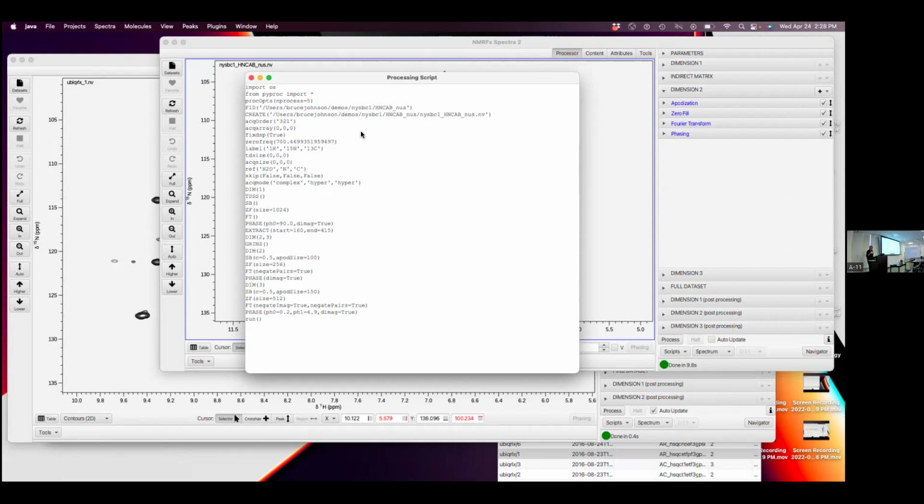And now acquisition mode. Acquisition mode, yes, complex, hyper. So that other experiment would have had complex, echo-antiecho. I used to actually put in an explicit operation that did those, and I decided it was easier to define those as parameters for how the data set was collected. There is still a time domain combine operation that will do it, and basically putting those in tells it to insert that operation.